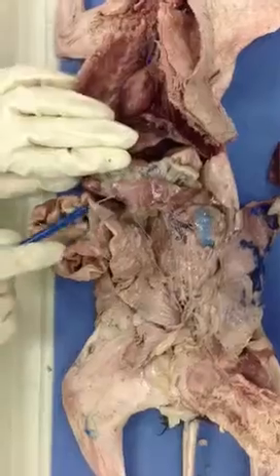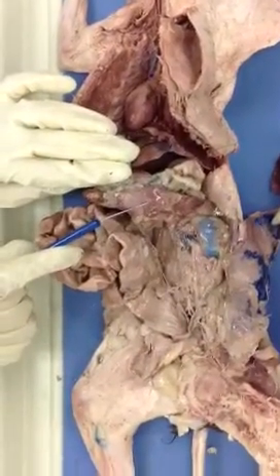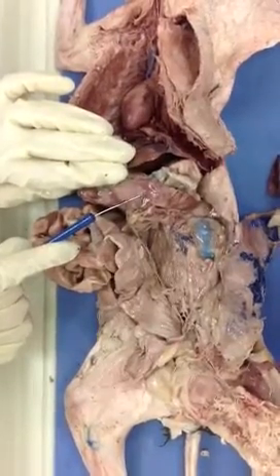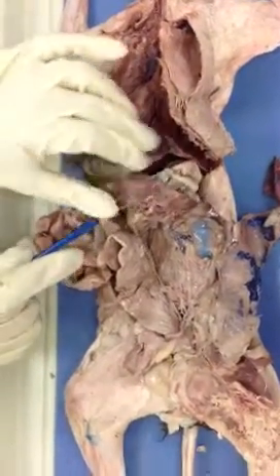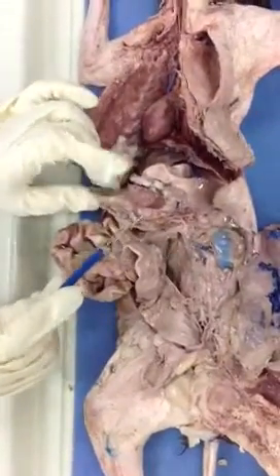Now, I encountered this organ. What's the name of this organ? Spleen. What type of organ is the spleen, please? Lymphatic. And what does it store? Blood. Very good.